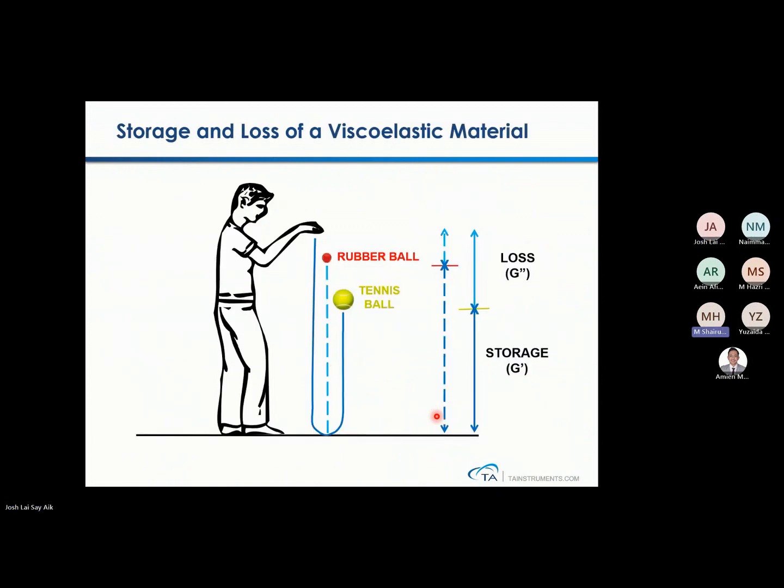With the tensile machine we go until what we call break. In the rheometer we ultimately don't do that. The peak of the tensile test goes until ultimate tensile strength, until it is broken. So you can see a difference, right? Here it's more like probing molecular mobility. Yeah, so you can see you have storage modulus and loss modulus. This is what we quantify when it hits the ground. The rubber ball will be more elastic than the tennis ball, because it has a smaller loss phase.